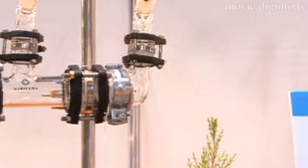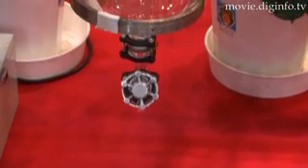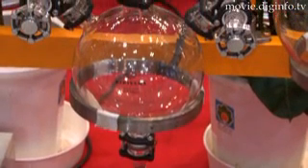The routes of the heating and cooling mediums can be easily changed for the sample by switching the valves.